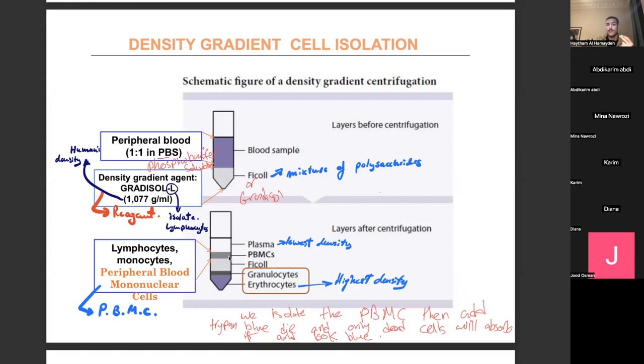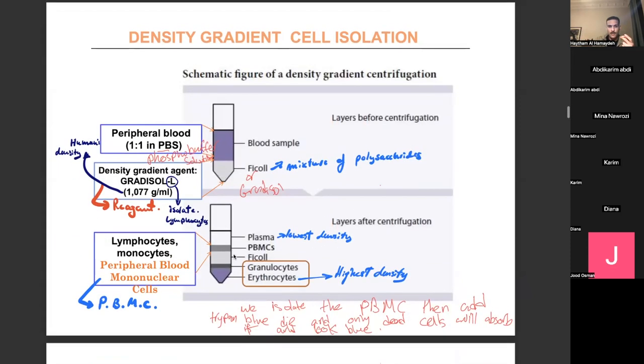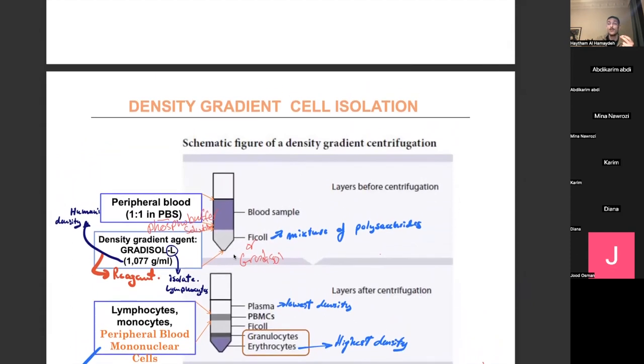We remember this was the foggy layer that you took with a syringe and put a drop on the slide and then put trypan blue. Can you guys remember what trypan blue was used for? Can you remind me? Because we said it in class. Wait, don't say it. I'll try to remember. We placed a drop on the slide, and then we put the trypan blue on it. I remember. The dead cells are taking the blue in, and the living cells fight it because it's very toxic.